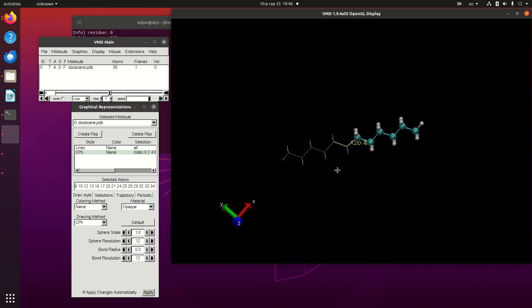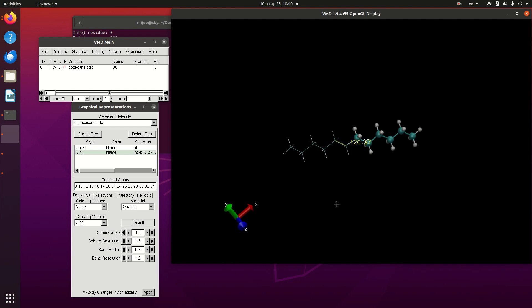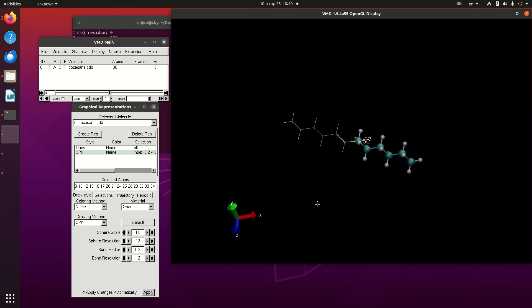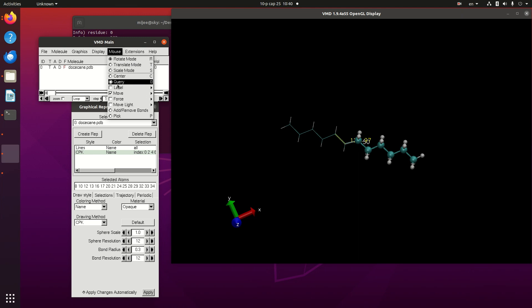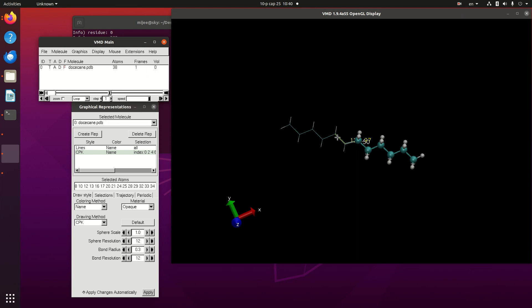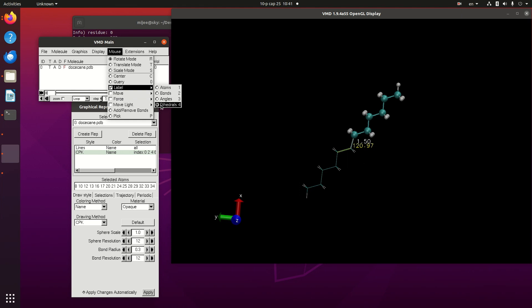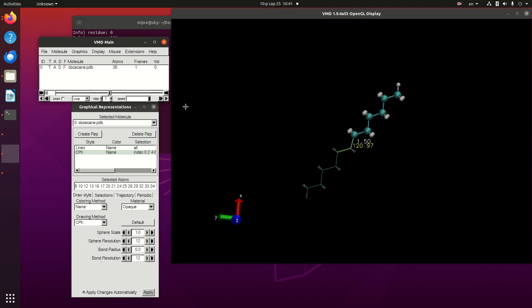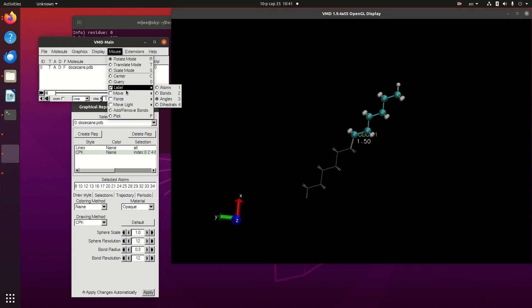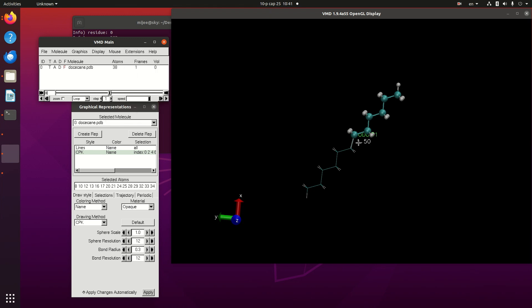We also can modify dihedral angle. I want to change the dihedral angle between these four atoms. Label, I want to label one, two, three, four. And change the label, remove this name. And bond length, I want to remove this bond length.